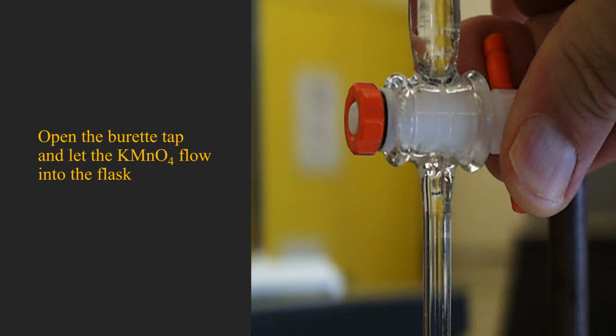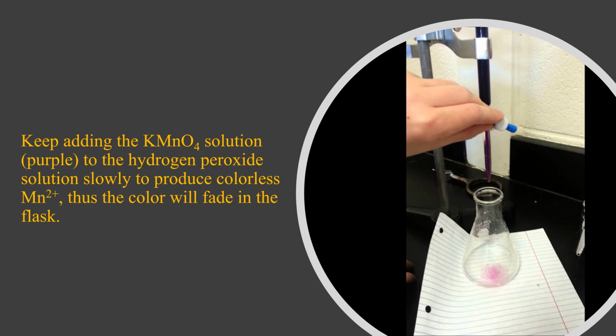Then, open the burette tap and let the potassium permanganate flow into the flask, and keep swirling the flask gently to make sure that the potassium permanganate and the hydrogen peroxide mix well and react. Keep adding the potassium permanganate solution, which has a purple color, to the hydrogen peroxide solution slowly to produce colorless manganese(II) ion, Mn2+. Thus, the color will fade in the flask when all the hydrogen peroxide has been used up. The last drop of potassium permanganate that is added will keep its color.